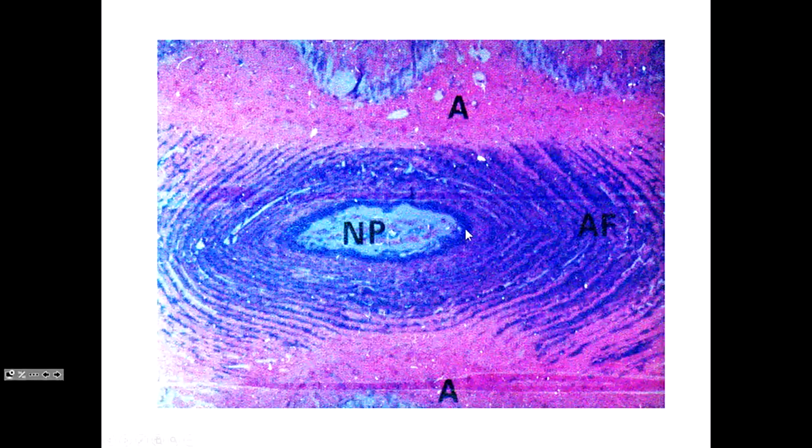Okay, so here is the intervertebral disc. This is the bone up here. Here's the nucleus pulposus. Here's the annulus fibrosus. In the annulus, this is where you'd see a lot of the fibrocartilage cells. This is a very low power light microscopic view, you can't make out distinct cells, but you can make out the annular layers, kind of like an onion. In those layers is where you will find those cells arranged in those long chains if you were to magnify it.